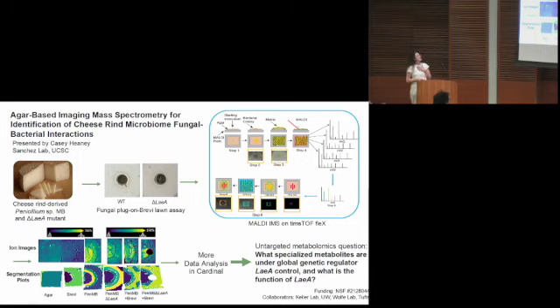To do that, I take a cut of the agar and put it onto a steel metal MALDI plate. From there, I apply matrix, and then put that into the instrument, where per each pixel, multiple spectra are generated and grouped into one. So I'm able to go through that spectra and see ion images, which reflect the relative intensity of the feature of interest.